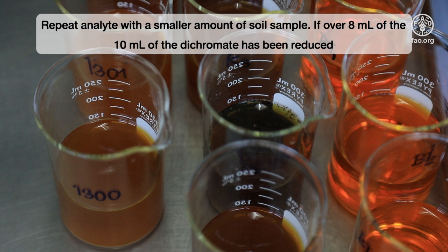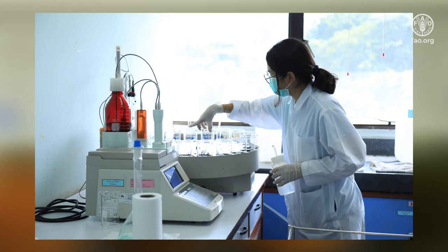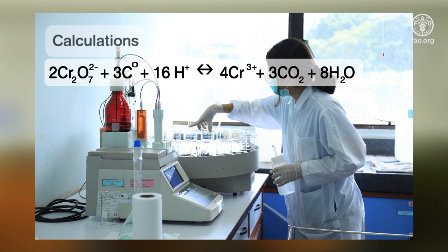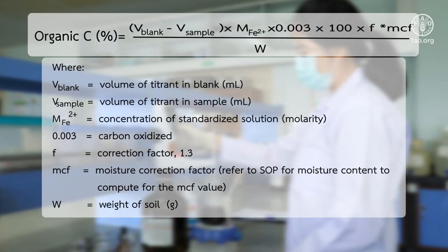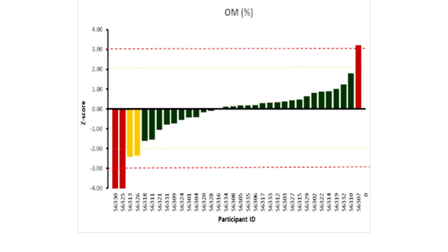the determination must be repeated with a smaller amount of soil sample. From the displayed equation, we can assess that 1 mL of 1 normal dichromate solution is equivalent to 3 mg of carbon. After the reaction, the excess of dichromate is titrated with 0.5 molar ferrous sulfate or 0.5 ammonium ferrous sulfate as the displayed equation shows.